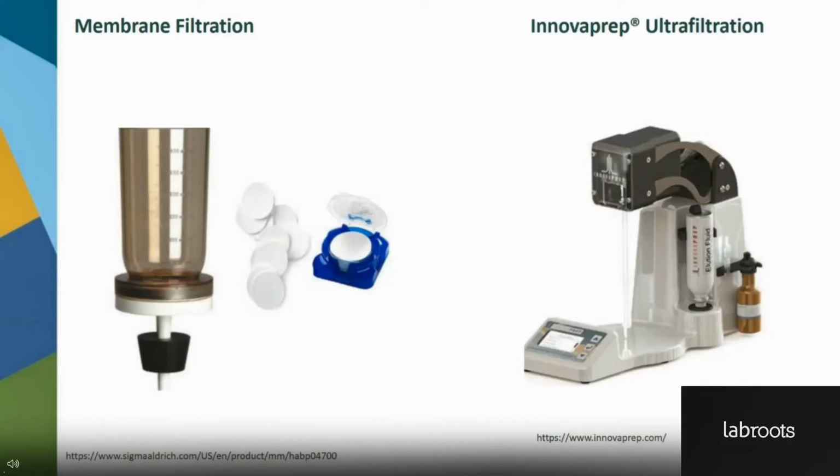InnovaPrep ultrafiltration system is a novel water processing method for waterborne pathogens. In our lab, we use it to concentrate 200 milliliter lake water samples for virus pathogens. The water samples will go through the pipette tips, and then the pipette tips will be eluted for the concentrated water samples, and then the concentrated samples will be ready for extraction.